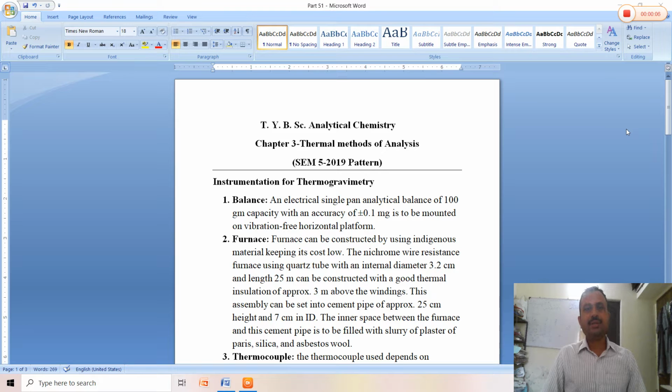Good morning, everyone. This is a series of lectures for analytical chemistry students. Chapter number 3, thermal methods of analysis, semester 5, 2019 pattern. In the last lecture, we learned some basics about thermogravimetry. In this lecture, we are going to learn about the instrumentation involved in thermogravimetry.